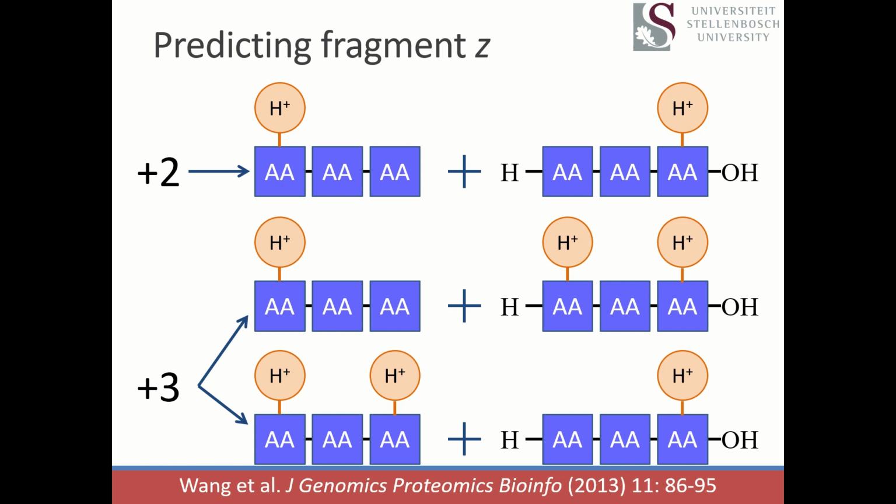That is different, however, when we get to the +3 scenario. What possibility did we ignore as we broke apart a +2? So yeah, we ignored the first peptide bond. What was yours? Where the charge was going to go.